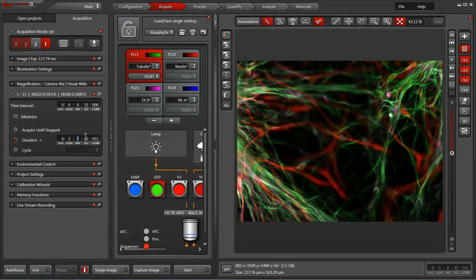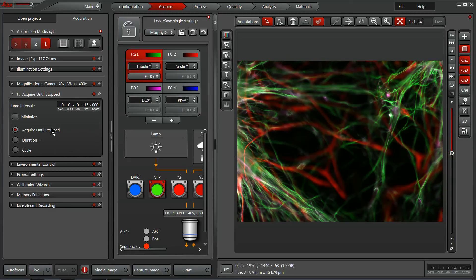We're going to go get lunch and come back and see it's finished. You can type the duration in manually, just like above. Or you can acquire until stopped — if you're sitting with the microscope and you know what your reaction is going to look like, you could watch in real time and allow the system to run until the memory is full or your reaction occurs, and you can stop the acquisition, all within the time-lapse dialog.